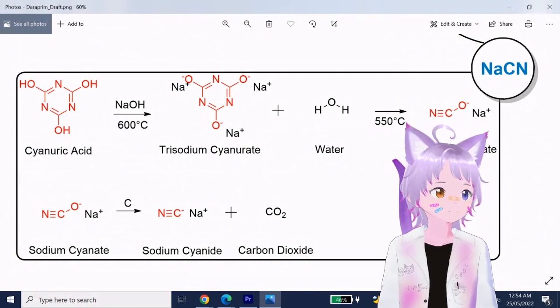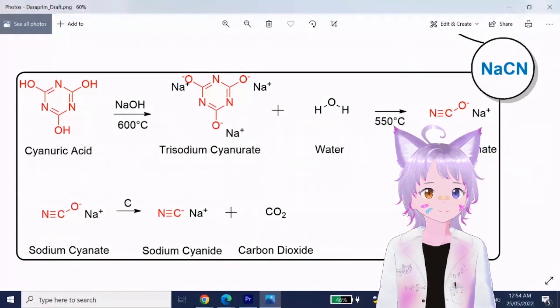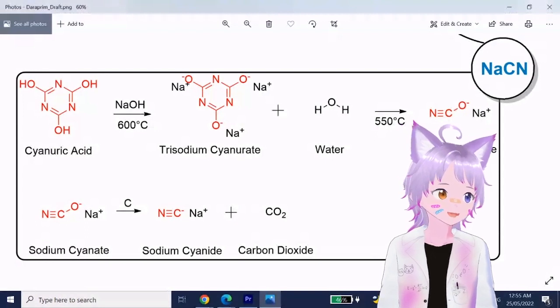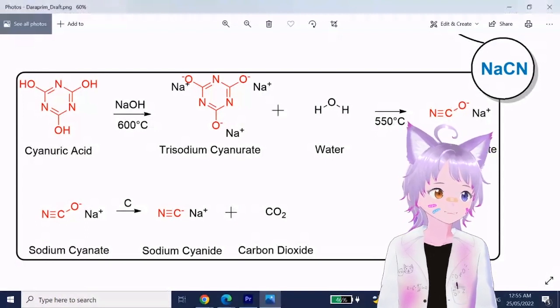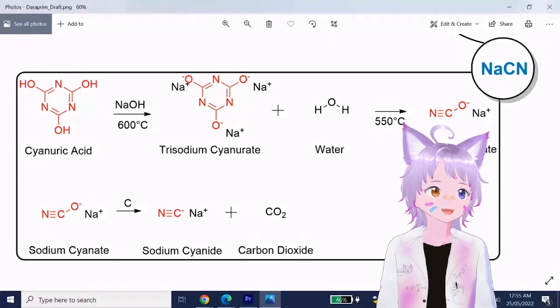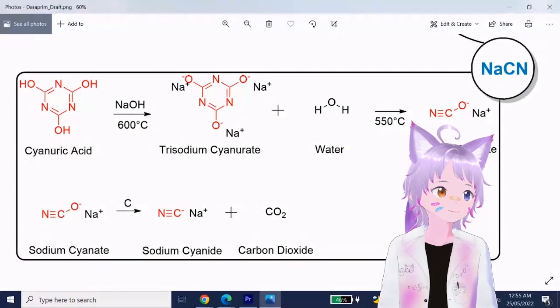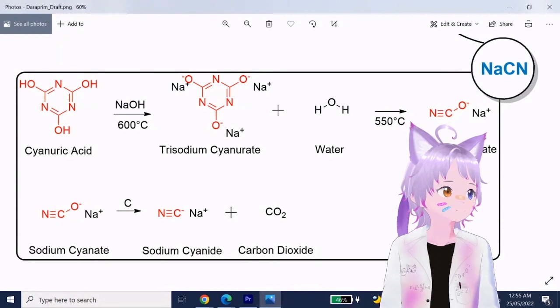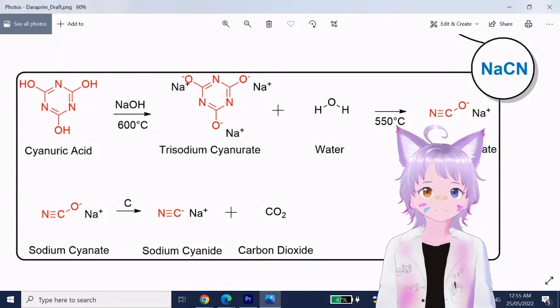And the way to do that is, remember the sodium hydroxide step, right? You could technically convert that batch into hydrogen cyanide gas and just bubble that through cold sodium hydroxide, but let's not. That would be suicidal.